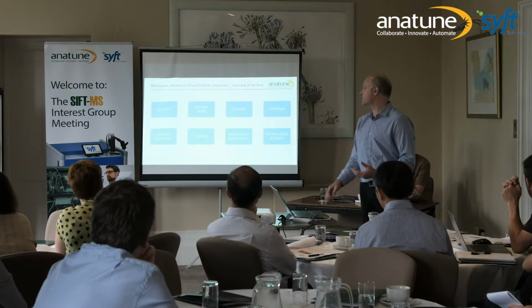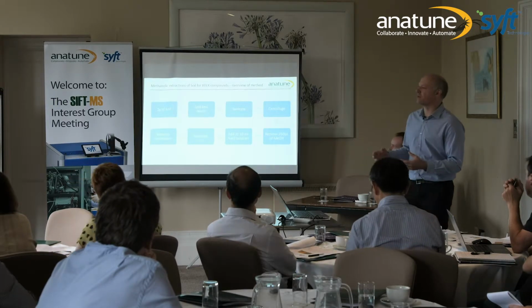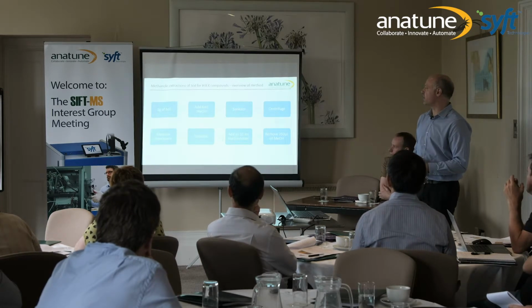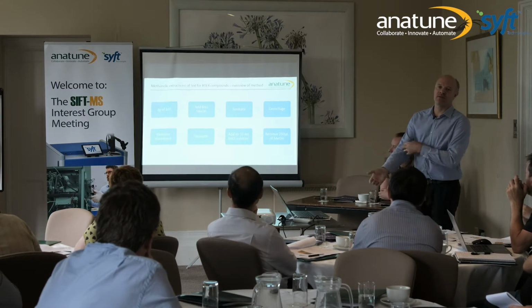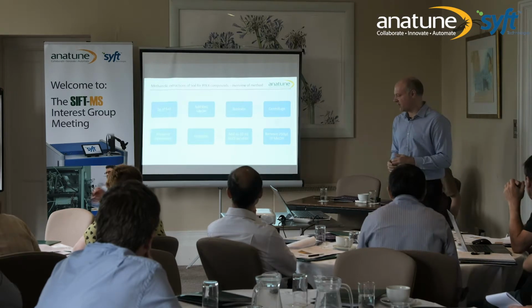So now I'm going to move on to a piece of work I did in the lab. This is a more complex method in the sense that it's got some sample prep up front, it's running calibrations in aqueous solutions and so on. So it's a methanolic extraction of soils for BTEX. BTEX compounds in soils is a particular environmental method that needs to be carried out around petrol stations and contamination around factories and so on.